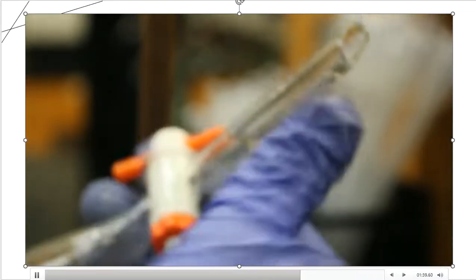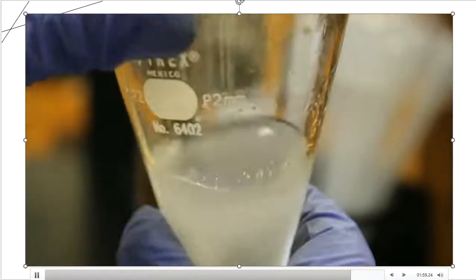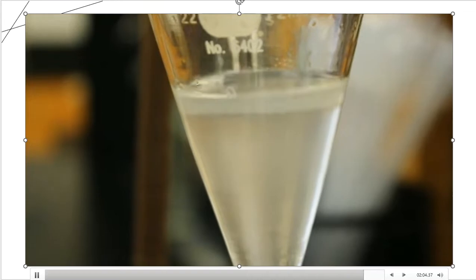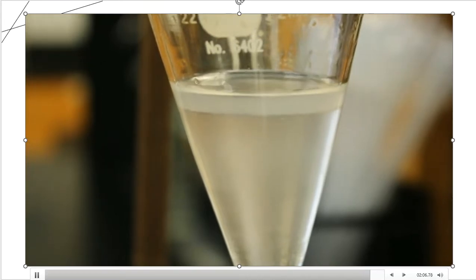You really do want these two layers to mix very well with each other. But if you do not vent the separatory funnel, then your pressure is going to build up and you could have an explosion on your hands. Methylene chloride is very volatile, so all of those vapors are going to fill up that separatory funnel if you're not careful. This is my third time doing it, and I heard the hiss, and I'll close it back. And now I'll put the separatory funnel back onto the ring stand, and I'll let it sit here for a few moments before I go further on the next step. Patience is a virtue, my friend.